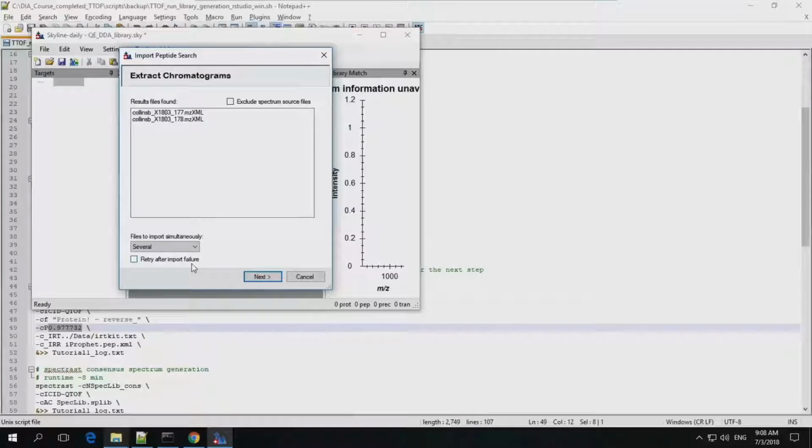Yeah, so that's what we had originally, and what I ended up feeling was better, because of that plot where I showed the rocket fins coming out, that there's too much variability in aligning just 10 points. So when I have DDA data, those two spectrum searches share thousands of peptides, right? And so what Skyline does now, the code in Skyline, is we align the runs to each other based on all the points that they share, which are going to be thousands.